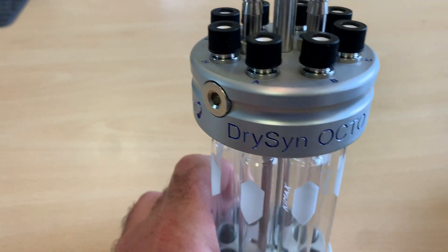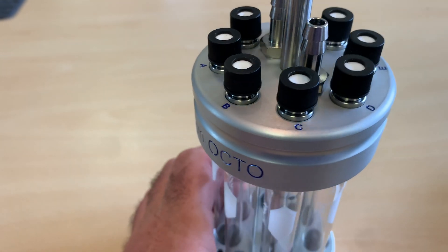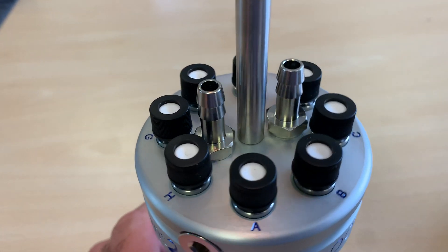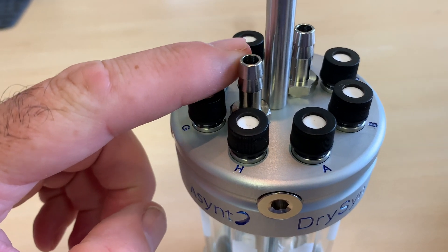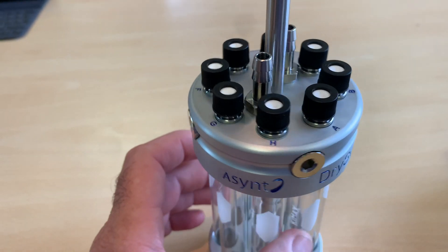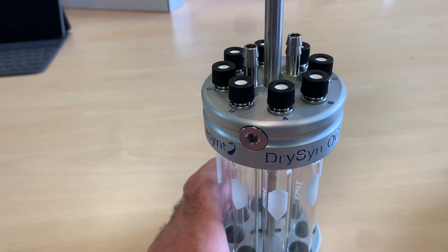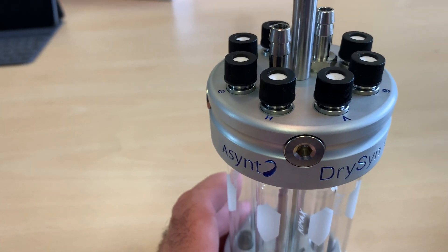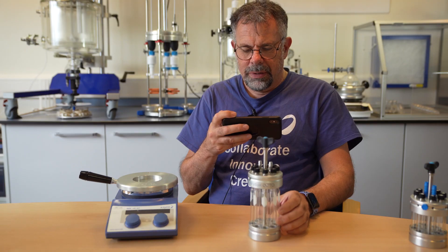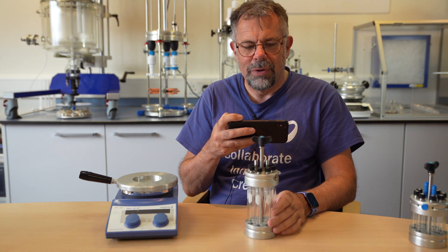We've worked a new manufacturing technique to keep all of those gas pathways internally. It costs us a little bit more, but we've now put 316 stainless steel fittings for the gas control, and the plugs are 316 as well. We haven't put the price up, but it just looks so much better. I'm really passionate that our products look good, and so is everyone at Asynt. When you get your Octo, hopefully you'll be as pleased to have it looking good in your fume hood as well.